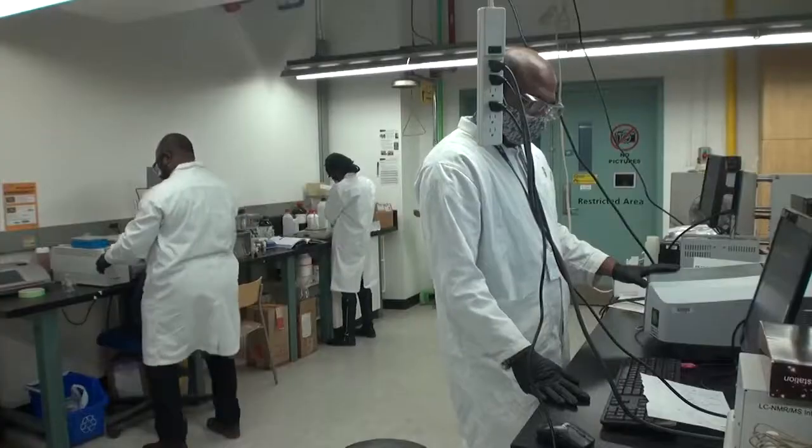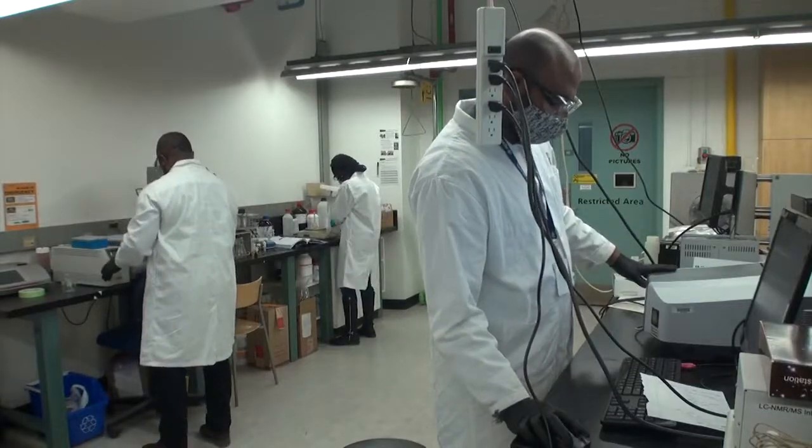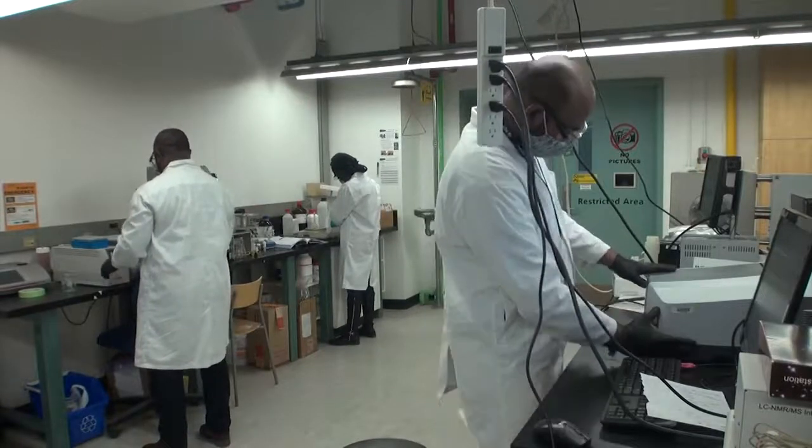More than $4.5 million in Canada Foundation for Innovation grants furnished much of the lab equipment at CETRI.